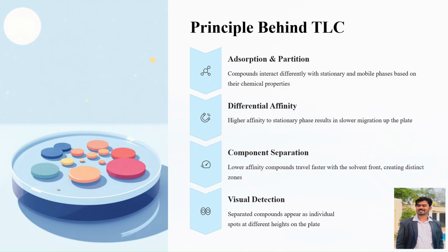And the second one is capillary action. And also the third principle is differential affinity, or the partition mechanism. The compounds that have the greater affinity for the mobile phase dissolve more easily in the solvent and move faster with it.